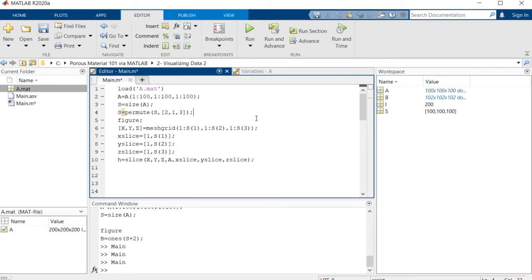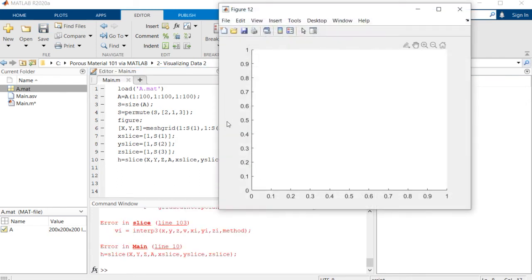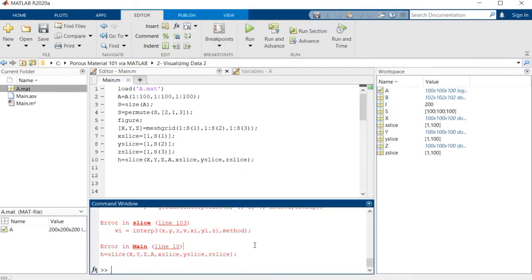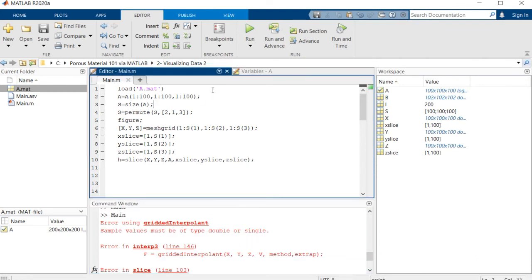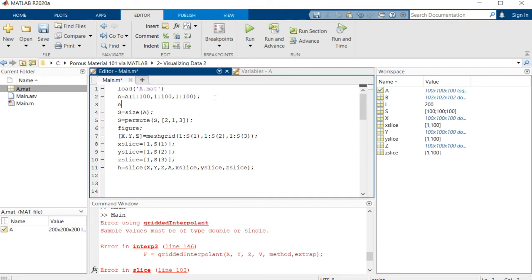If we simply run this command, let's see what's the problem. Okay, we need to change the format of this array into double to make it work.